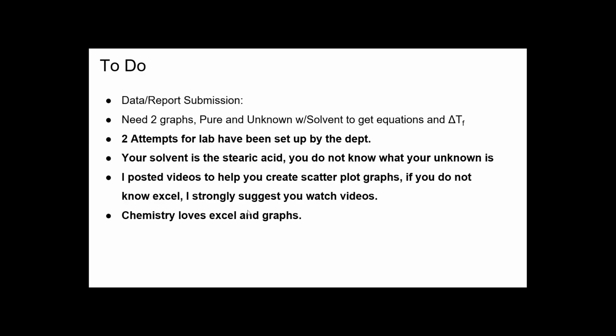Okay? And let's see, data report submission. You need 2 graphs. You absolutely need 2 graphs. You will upload them. You have 2 attempts for this lab. Can be a really confusing lab, but honestly, in my opinion, it's not as hard as other labs you've done. It really isn't. And I specifically have tried to break down things as much as I could to even help more. Everybody's solvent will be stearic acid. You're not going to know what the moles are of your unknown.